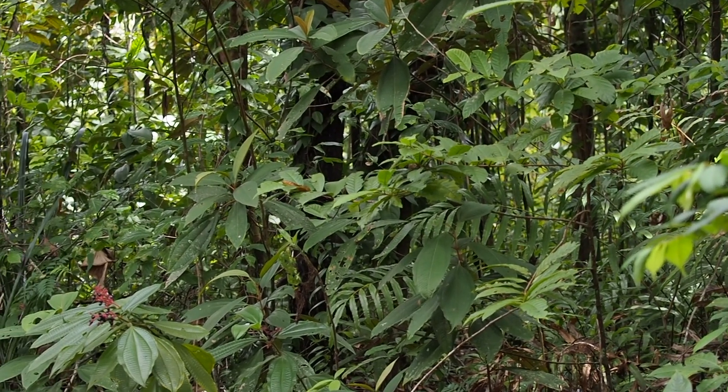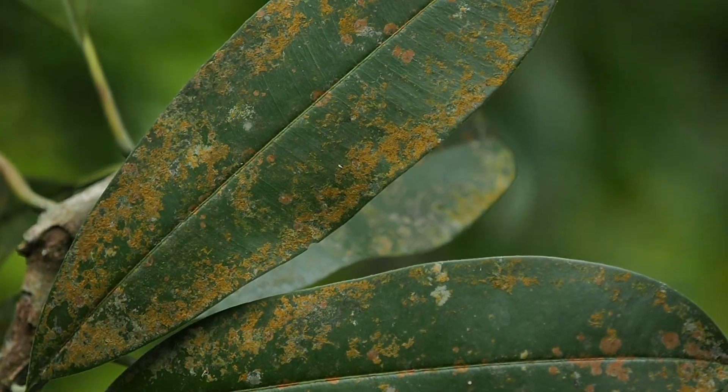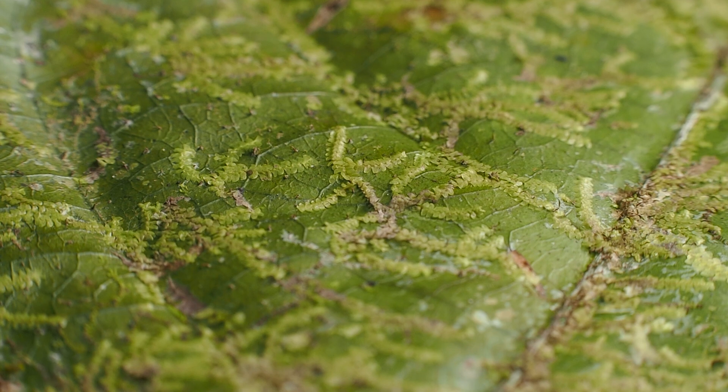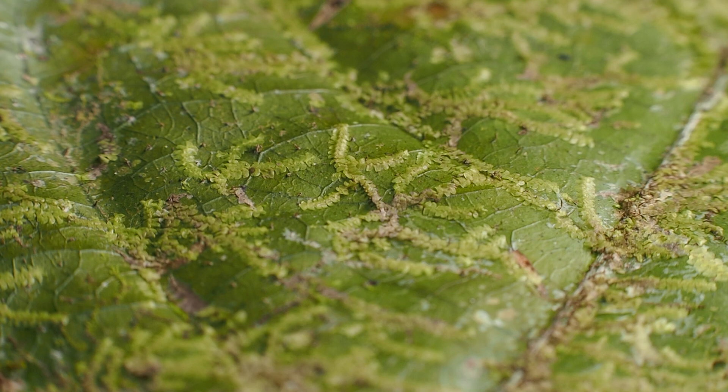Epiphyllous bryophytes are those that grow on the leaves of vascular plants. They are quite common in the humid tropics. In this video, we are going to show you how to remove and study epiphyllous liverworts under the compound scope.